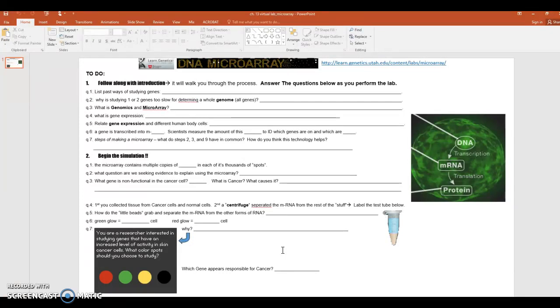This is cutting edge technology, and this is helping people learn a great deal about how active or inactive their genes are, and how scientists and lab people and doctors are all using this technology to better understand the genes involved with other people's diseases and illnesses.